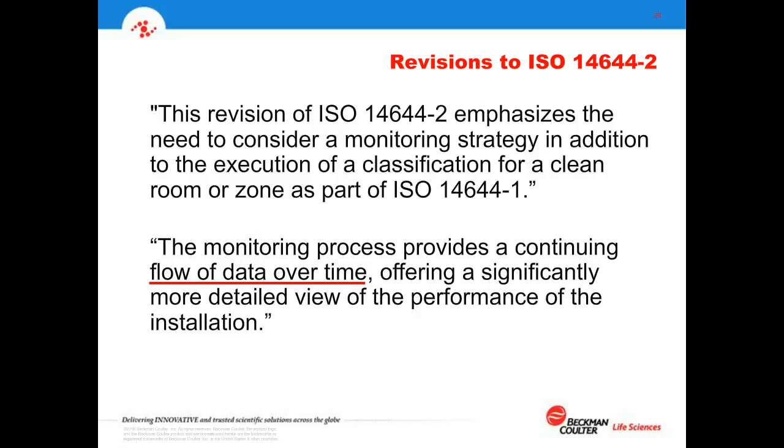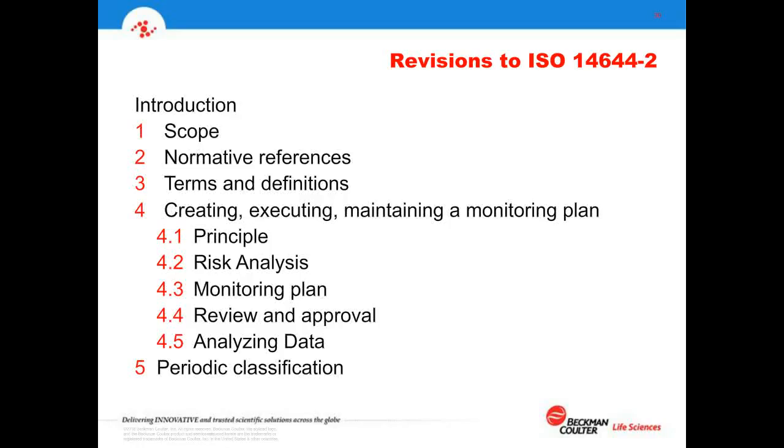So do we know each day or each week that we're still within the boundaries we seek for our process environment? And this is what monitoring does. In this framework, then, we look at the aspect of creating, executing, maintaining a plan, and that's pretty familiar to most people working in the pharmaceutical, biopharma environment.